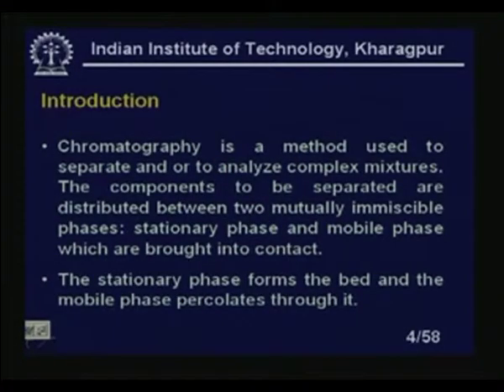The stationary phase forms the bed and the mobile phase percolates through it. So we have a bed, the packed bed column we are talking about. That stationary phase will make that bed and the mobile phase will percolate through it.